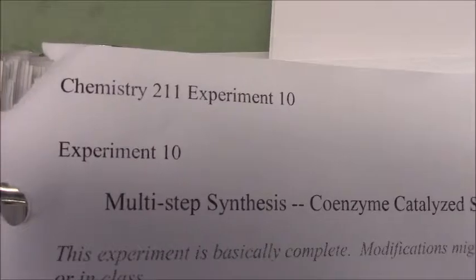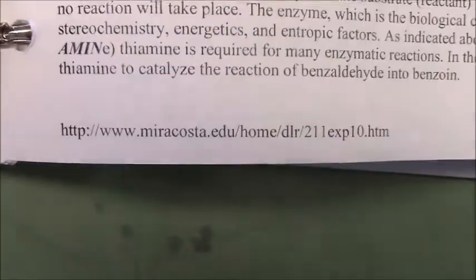So for instance, I found this one years ago. Somebody did a multi-step synthesis, the exact one we're doing. And they even outlined talking about the thiamine. That's the website I used years ago. So you turn, and this abounds. There's many people who do this.